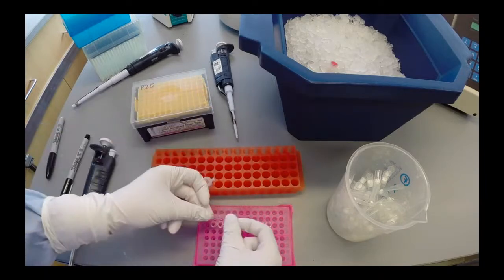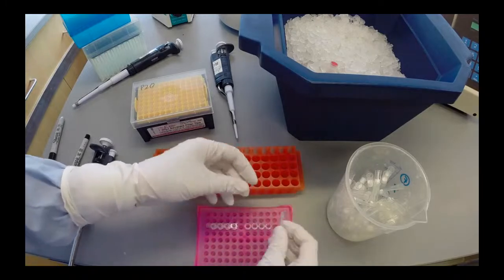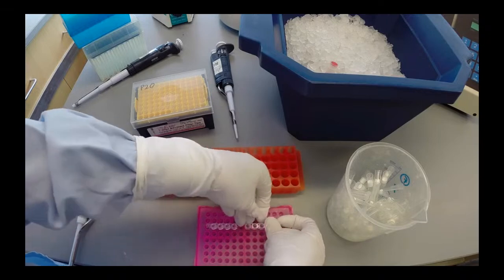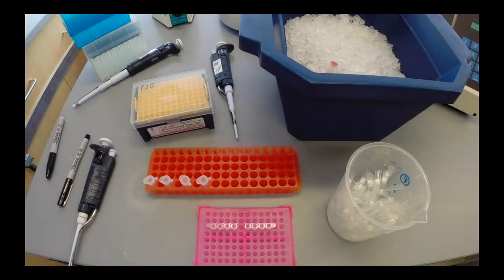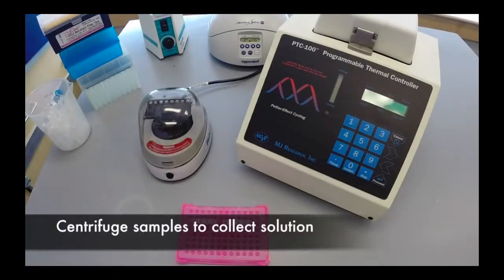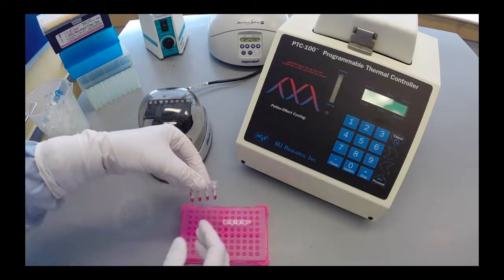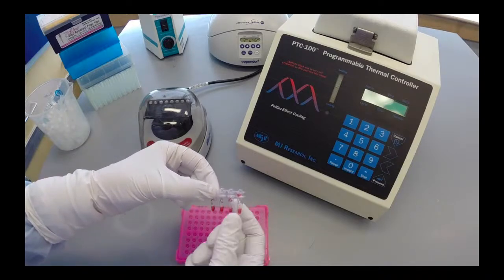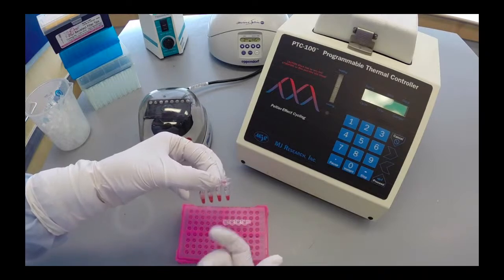Cap the tubes tightly and flick to mix the samples. Use the mini microcentrifuge with the 8-tube strip head to collect the solution at the bottom of the tube. It is good practice to always mix and collect solutions before every step, especially if the solutions have been sitting for a while.